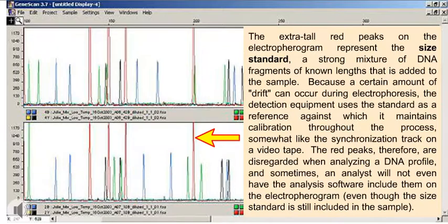The extra-tall red peaks on the electropherogram represent the size standard, a strong mixture of DNA fragments of known lengths that is added to the sample. Because a certain amount of drift can occur during electrophoresis, the detection equipment uses the standard as a reference against which it maintains calibration throughout the process, somewhat like the synchronization track on a videotape.